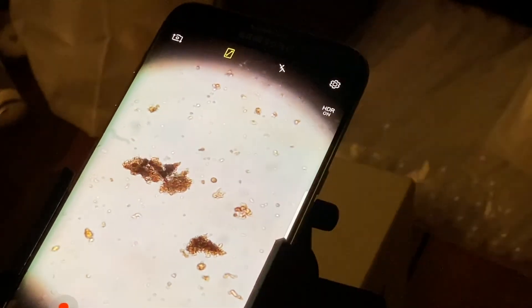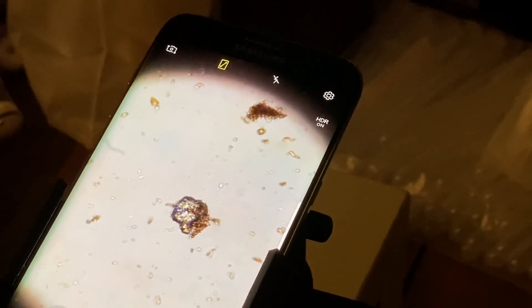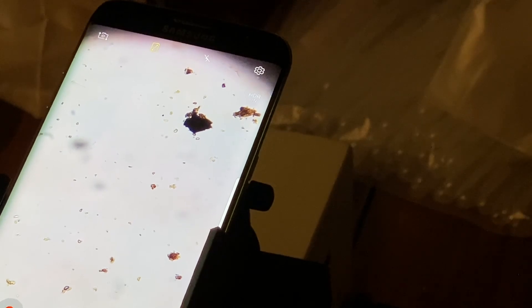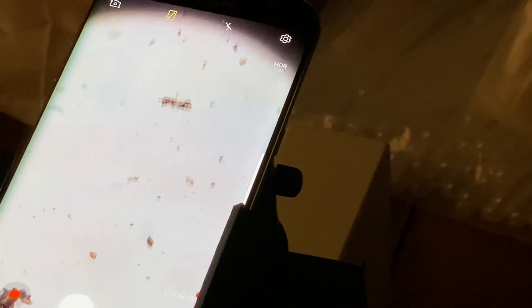Nice humic acid there. More humic acids. We've got some biochar with humic acids binding to it. You can see all the different colored specks and biology around that. That's cool — lots of life.